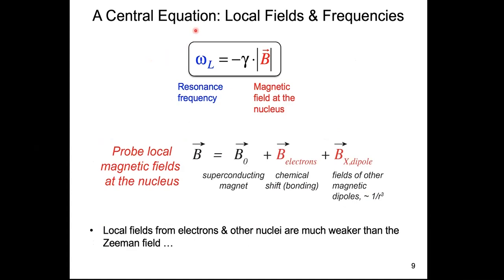nutation. Now, you see that in NMR, this omega equals minus gamma B is really a central equation. And I can put different subscripts into such an equation to mean slightly different things. You have seen the Larmor precession; I like to write omega 0 because the B field is B0. And when it's applied RF pulses, then I like to write omega subscript 1 because that's gamma B1. But I really want to generalize this to subscript L, not to be confused with Larmor, that's a local field, let's just say. And here I want to have this minus gamma B, a very general B.